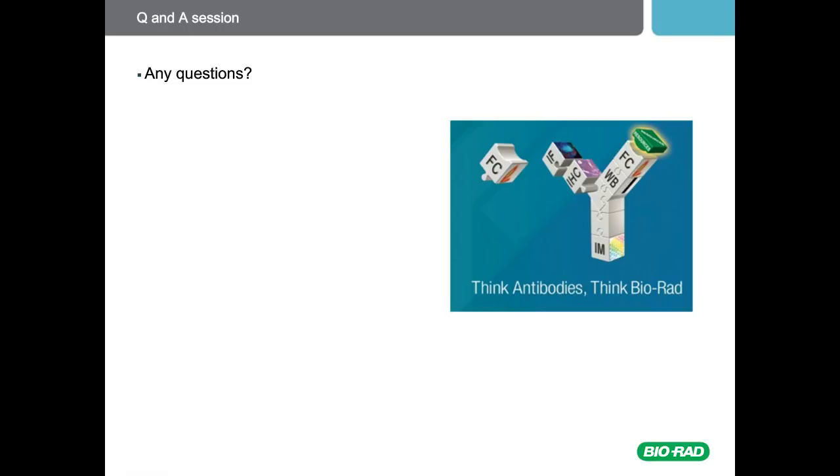If you're worried about your surface markers changing, then I would not recommend leaving frozen samples overnight. I would stain them as quickly as possible, and if at all possible, I would actually stain fresh cells, because you will have much better viability with your fresh cells.